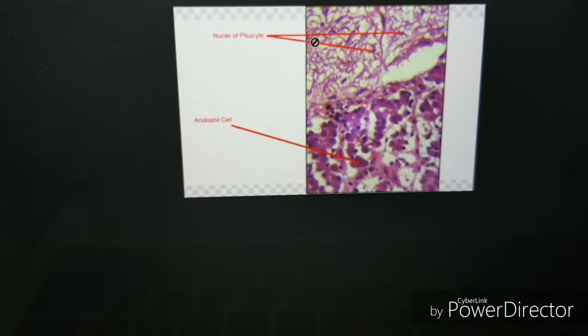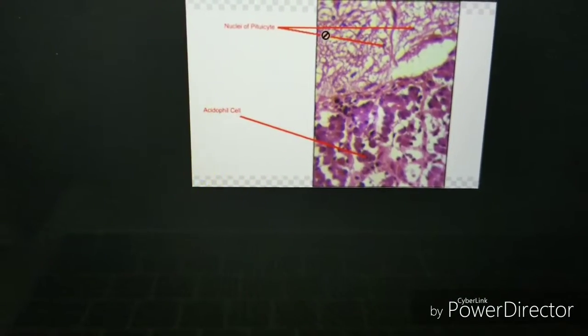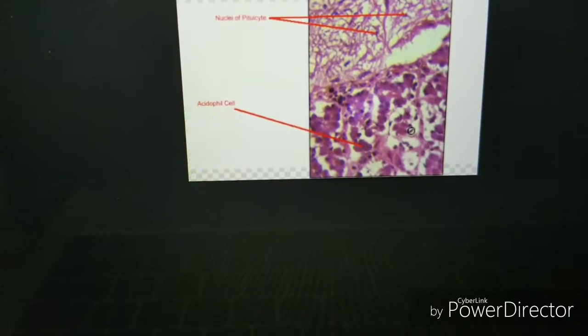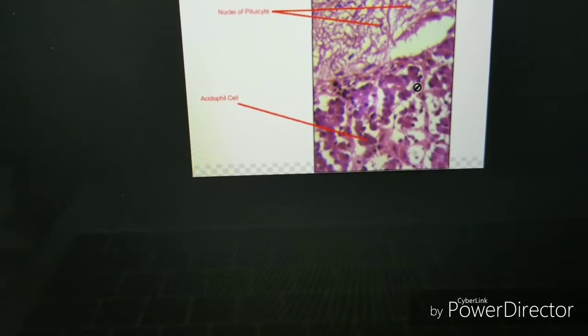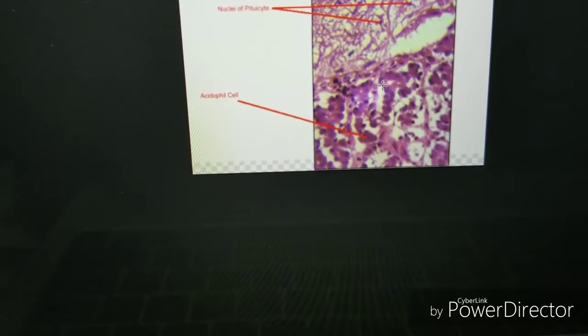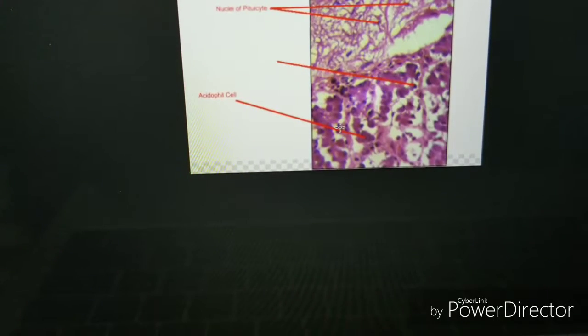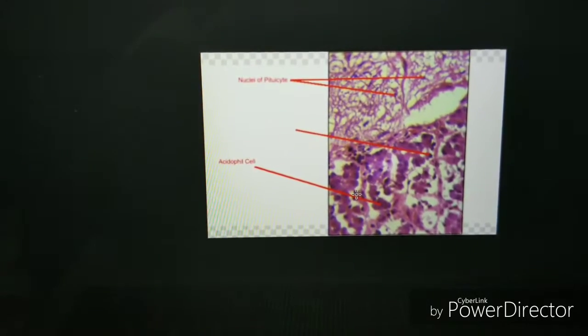Wonderful. Now let's find one of those basophils. You can see it's actually very noticeable. There's a few we can choose from. Let's go ahead and do this one. I'm going to point it out here. Say you want to do another one, you could. I'm just going to keep it at the one.